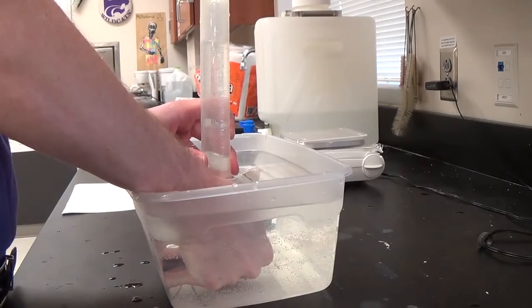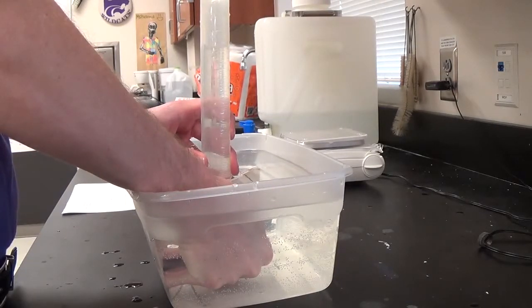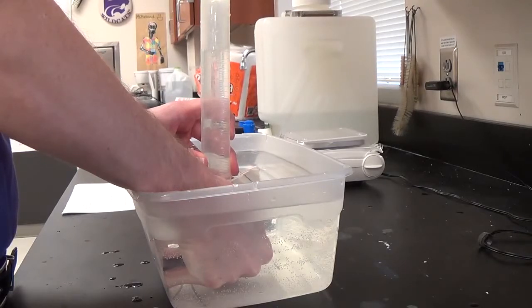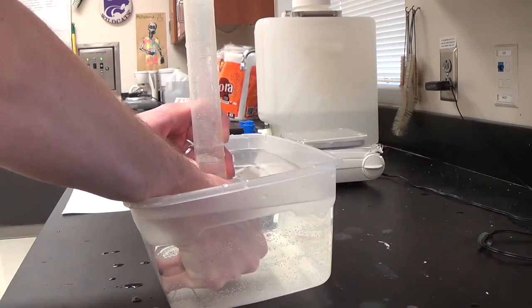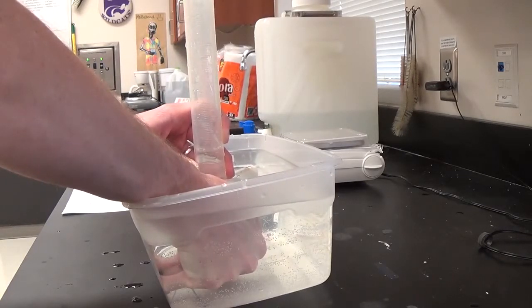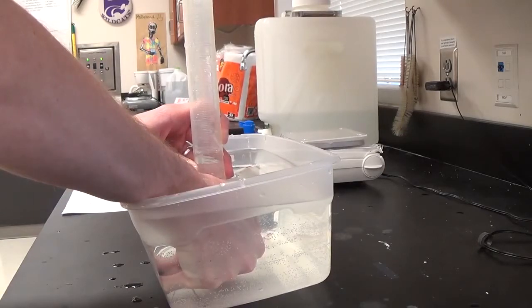As you collect the gas, you can see the bubbles here going up into the graduated cylinder. Keep collecting until you get close to about 95 milliliters. Remember that the graduations are upside down. When you get to about 95, you can stop.